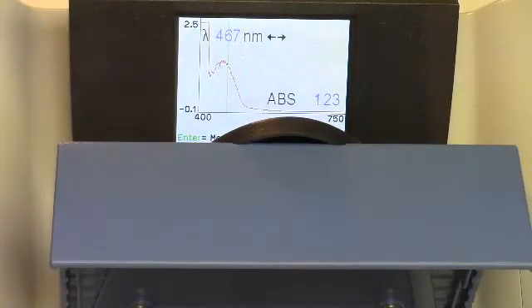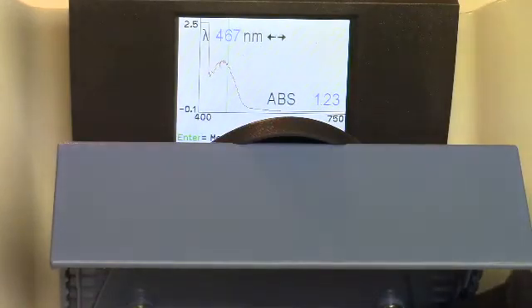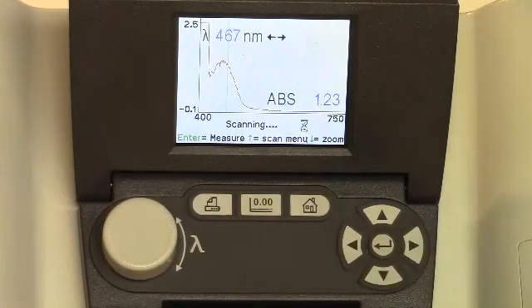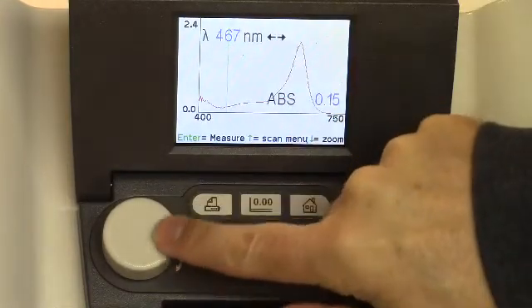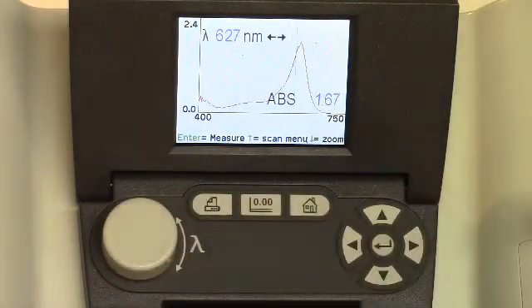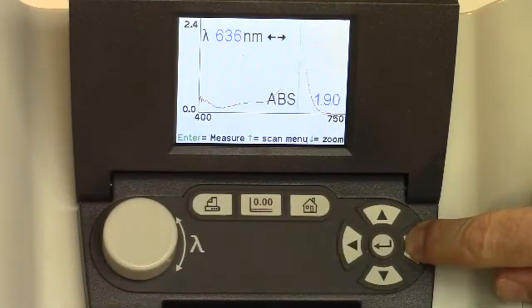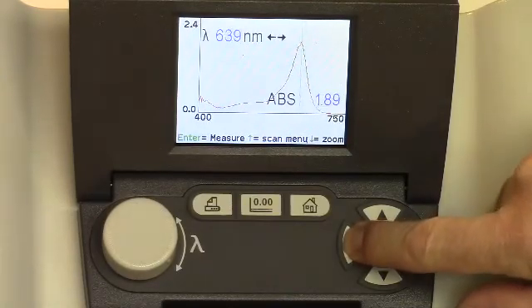We've got one more we're going to try, and that's a blue sample. This is my favorite color right there. So we'll put the blue sample in. And it helps to make sure there's no bubbles in your samples. Those can cause some weird artifacts and affect the absorbances there. And so there's the absorbance spectrum for blue. We've got this big peak down on the right-hand side here. So let me bring it over into there. And then we'll just scan one nanometer at a time across there. You can see it drops off pretty quickly there.